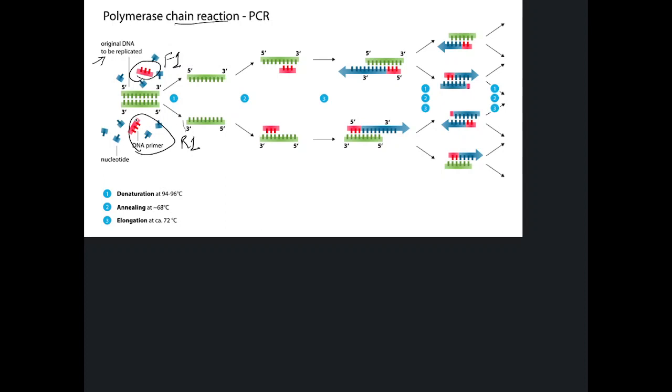Besides this, you need the buffer, the optimum annealing and denaturation conditions. You require the dNTPs, that is deoxynucleotide triphosphates, that is dATP, dCTP, dTTP and dGTP. All this is required, and it essentially consists of an initial denaturation step where your DNA is being separated, meaning that hydrogen bonds are broken. Then the primers come and bind on the basis of complementarity over the sequences.